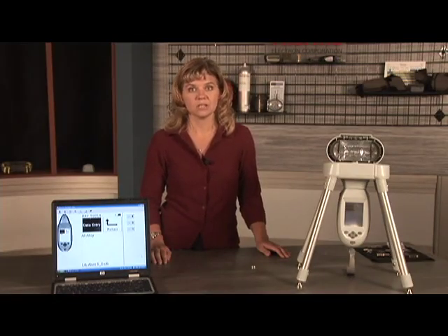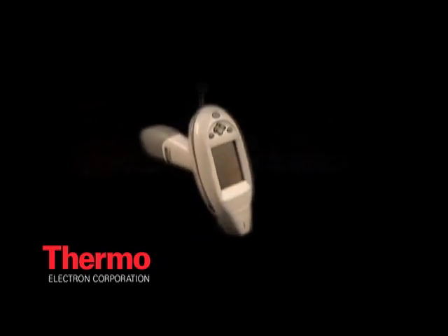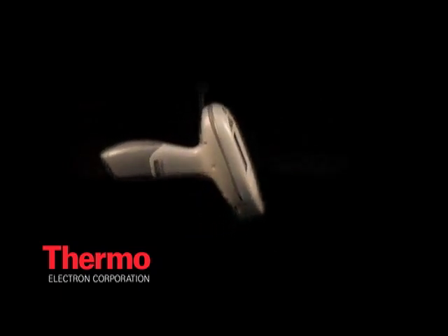This precious metals analysis mode is useful for jewelry dealers, precious metal producers, and reclaimers of precious metals. This mode can be added to existing Thermo Niton alloy analyzers. If you would like to add this mode to your instrument, contact your local representative for pricing and details.